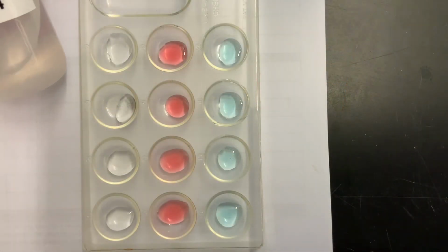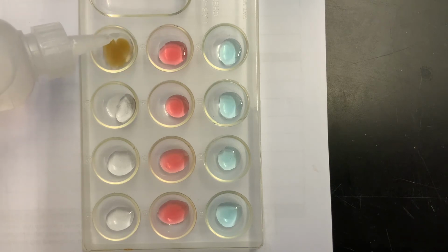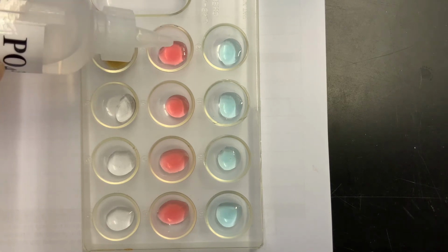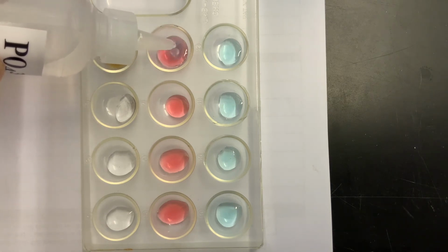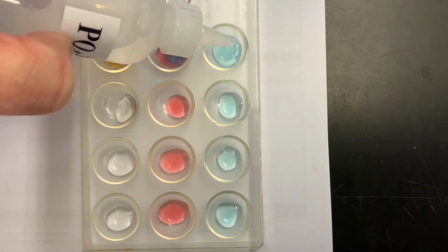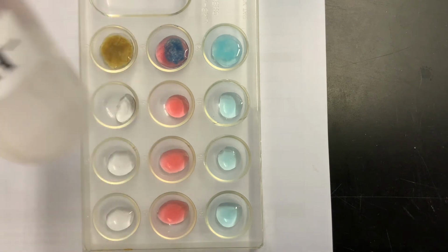You should be watching this video while looking at your lab sheet because it is arranged the same way as your data table. Phosphate first, added into the silver, getting a yellow-brown precipitate, and now phosphate ions added to the cobalt, a bluish-whitish precipitate, and phosphate ions added into the copper ions, also a cloudy precipitate.